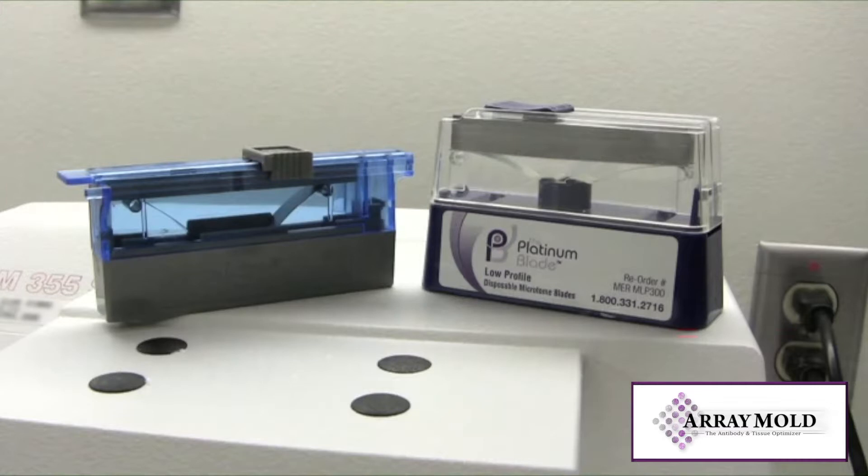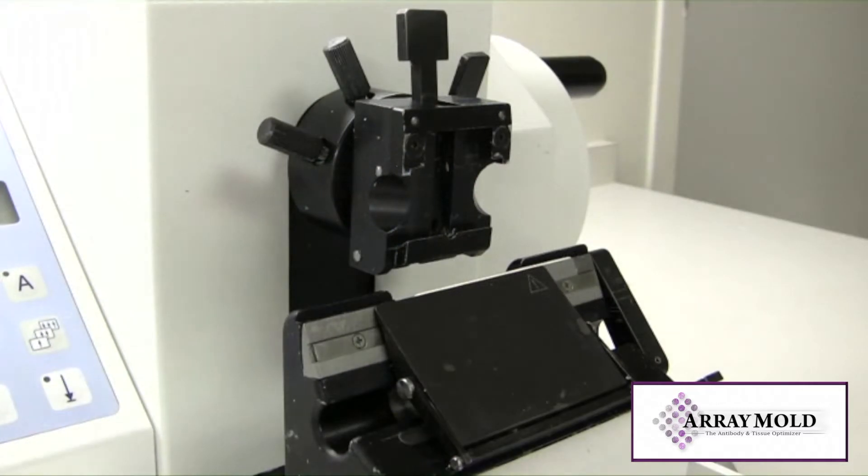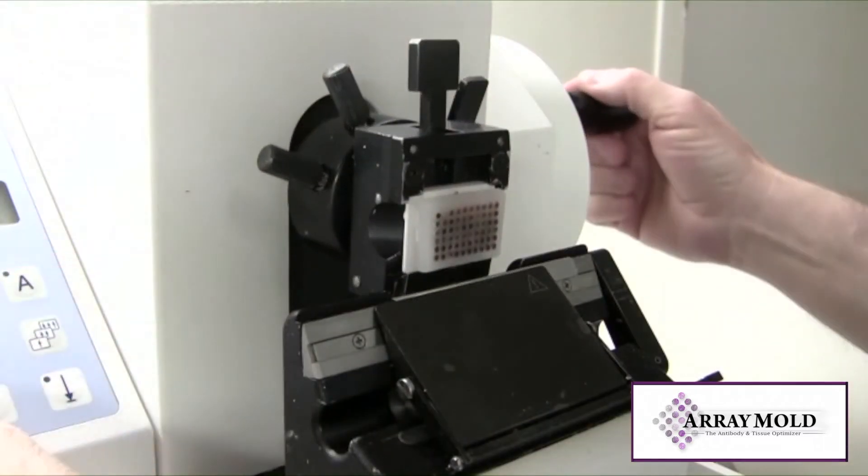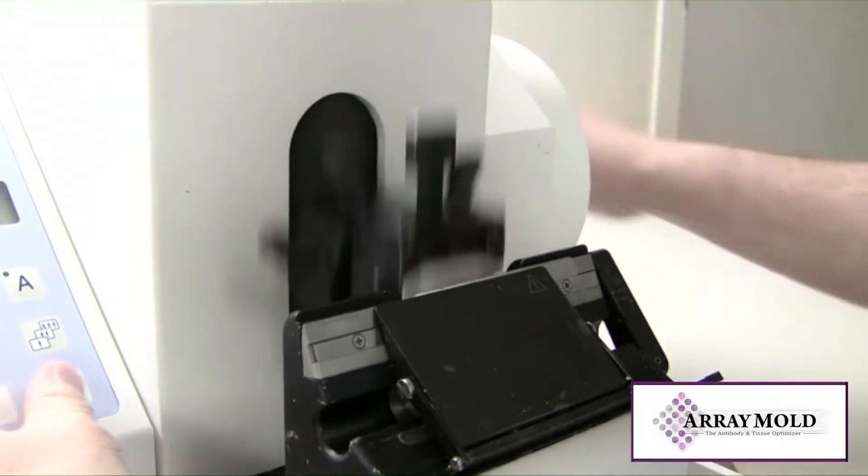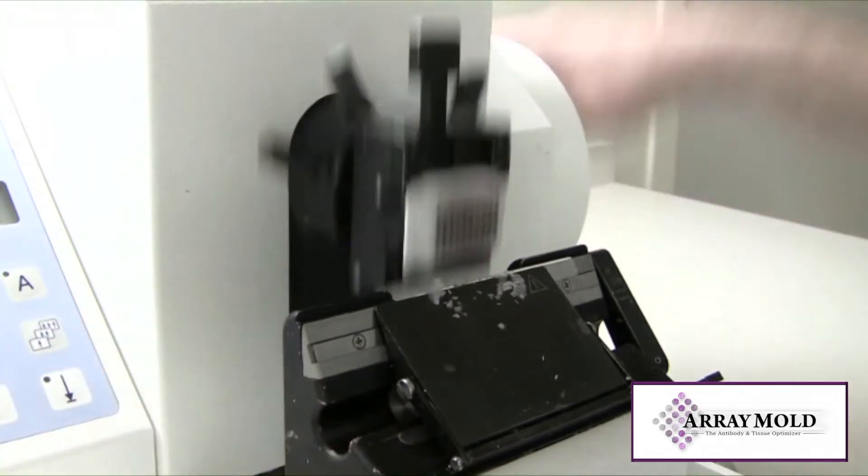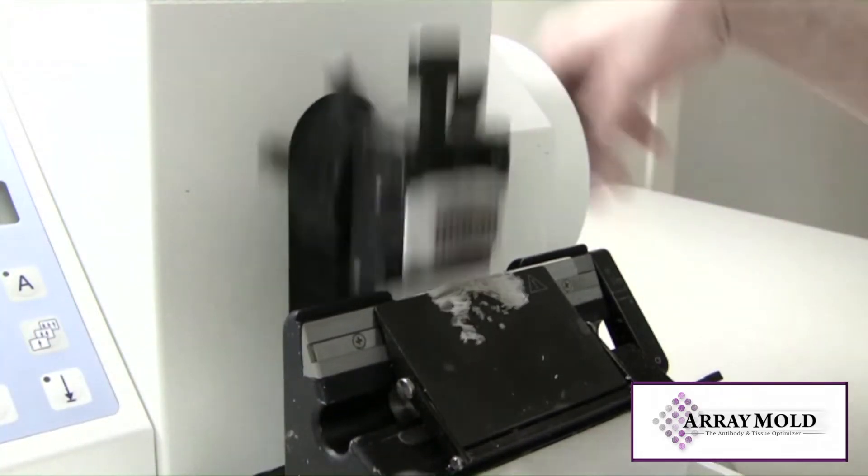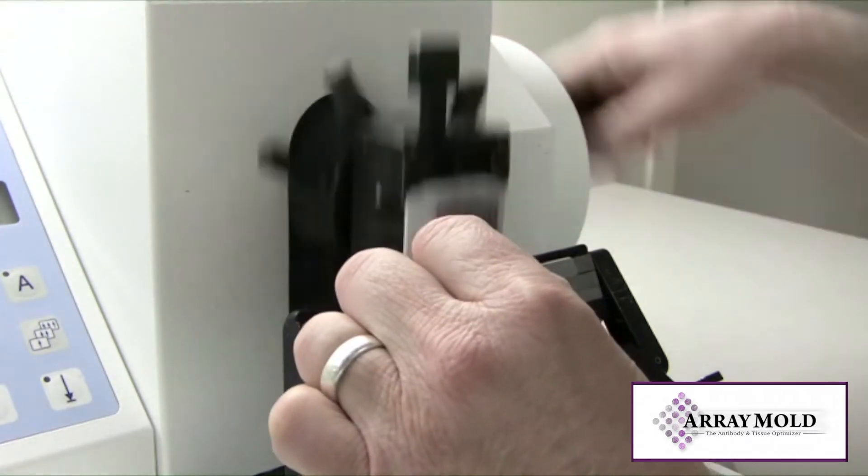I'm not going to cover cutting procedures because there are as many techniques as there are histologists. First trim into your array block so the surface is flat. If your microtome chuck is at a different angle than your array block, you may want to adjust the chuck so it's flat against the block. You don't want to cut away valuable tissues facing into your array block.